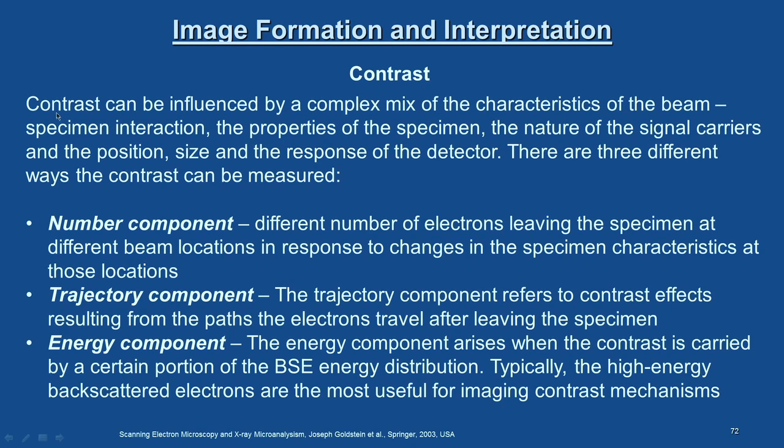In SEM, contrast can be influenced by a complex mix of characteristics of beam specimen interaction, the properties of the specimen, the nature of the signal carriers, and the position, size and response of the detector. You see n number of variables now come in to contribute or influence the image contrast.